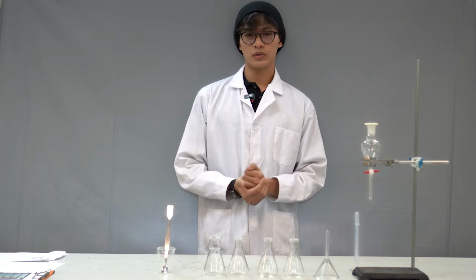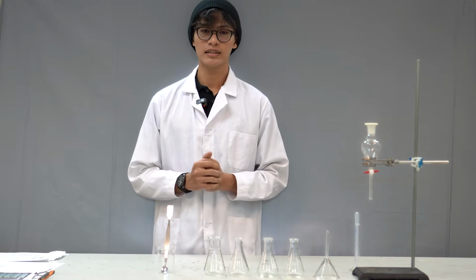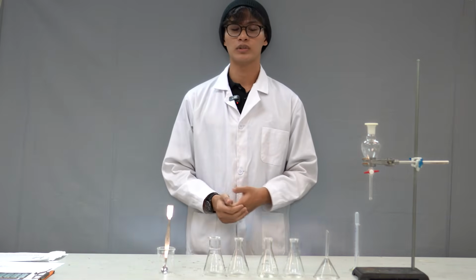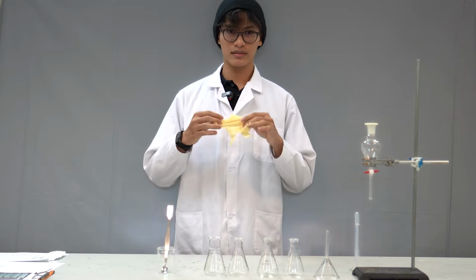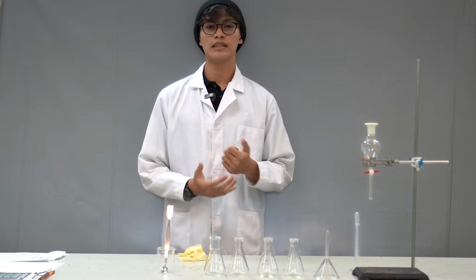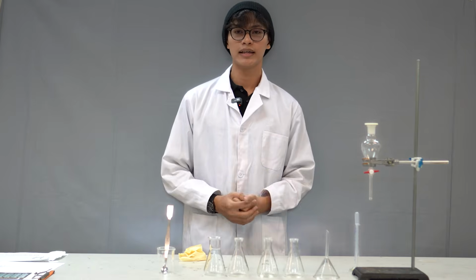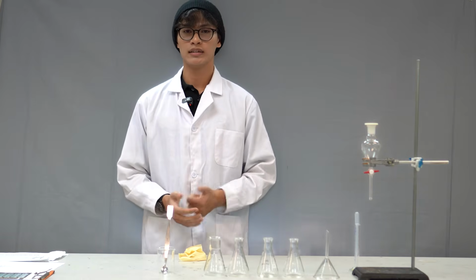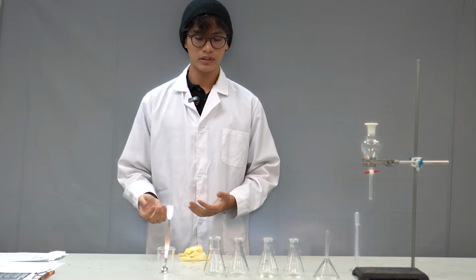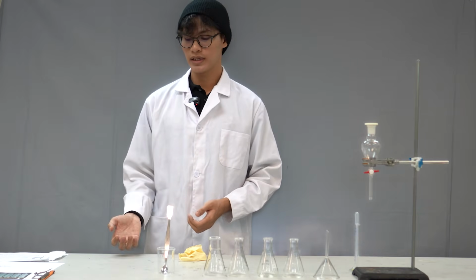So now, moving on to the last part, which is the precautions. For general safety and personal protection, each of us wore long sleeve lab coats like this and chemical resistant gloves, which are like this, the latex gloves. In the experiment, one of the substances that we used is diethyl ether, which is known to be extremely flammable, and its vapors are heavier than air. So, if the substance is handled incorrectly, the vapor of the diethyl ether can travel along the tabletop and be ignited by a nearby heat source.